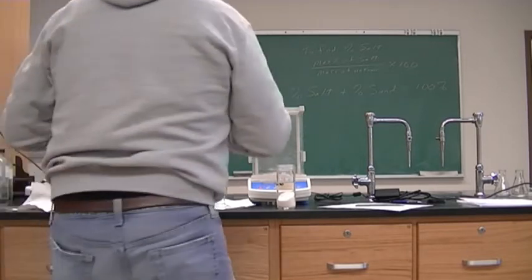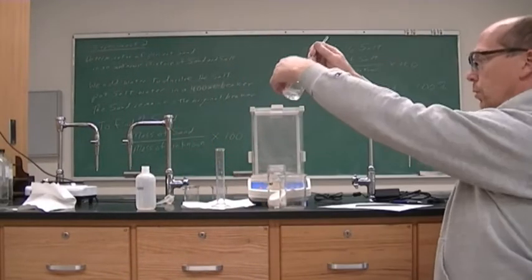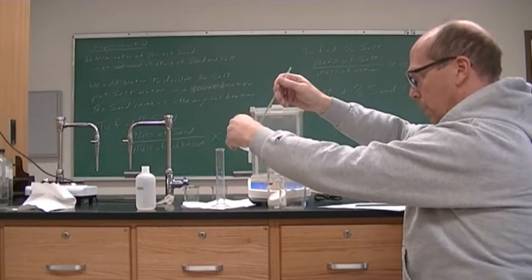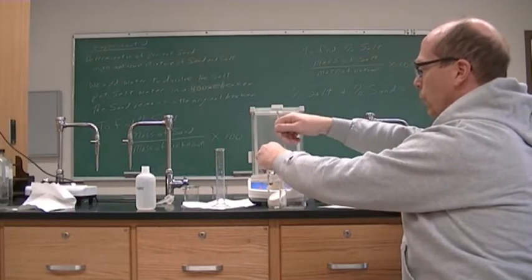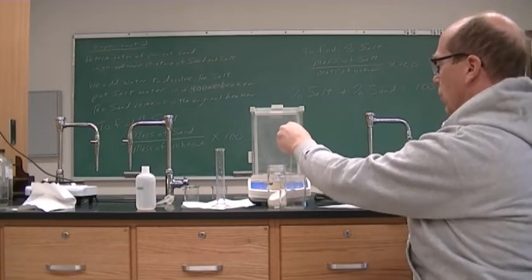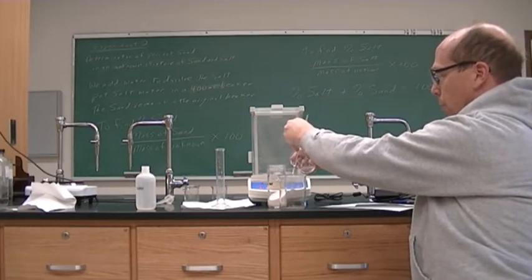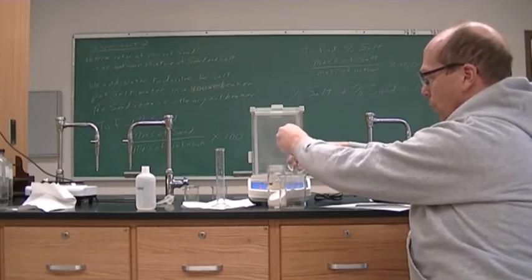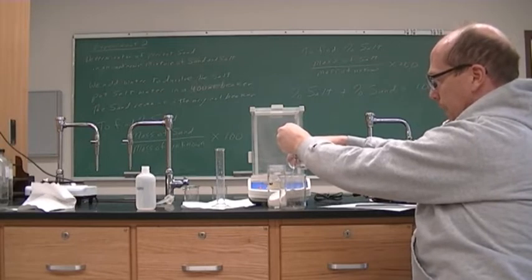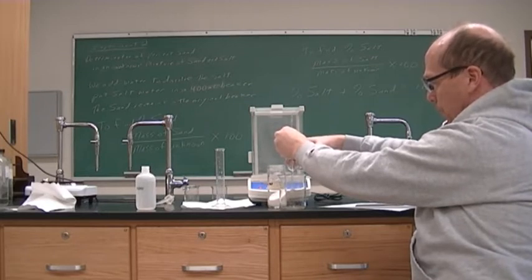Here I have a large beaker that I'm going to put the salt water in. All the salt that's going to dissolve has dissolved, and so we're going to decant. The stirring rod is going to help keep the sand from coming through — we want all the sand to stay in the small beaker and the salt water to all go into the large beaker. This is called decanting, so that any solid that tries to escape gets stopped by the stirring rod and remains in the small beaker.